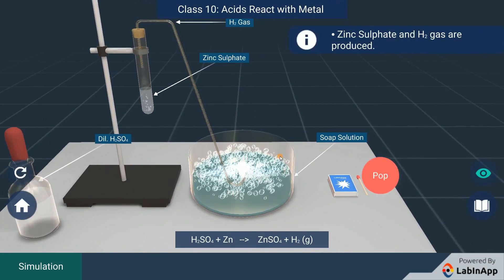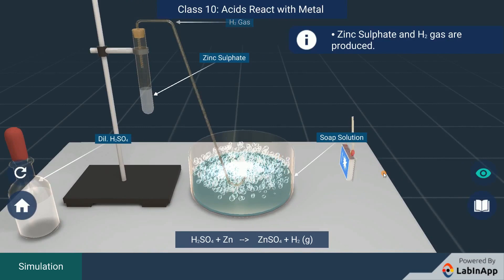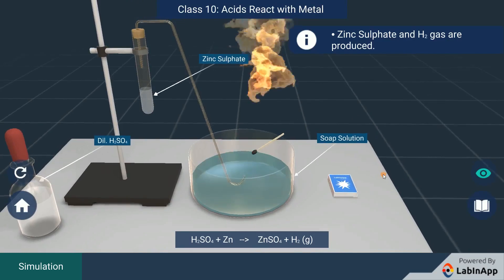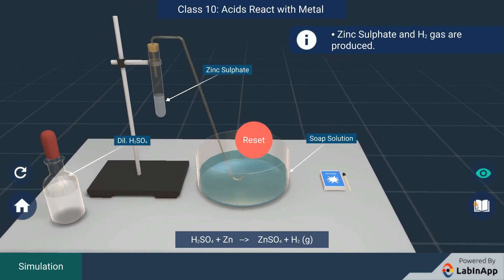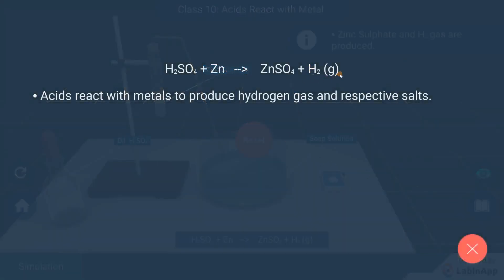Bring a burning matchstick near the surface of the soap solution. You can observe the burning of hydrogen gas with a pop sound. This indicates the presence of hydrogen gas in the bubbles.